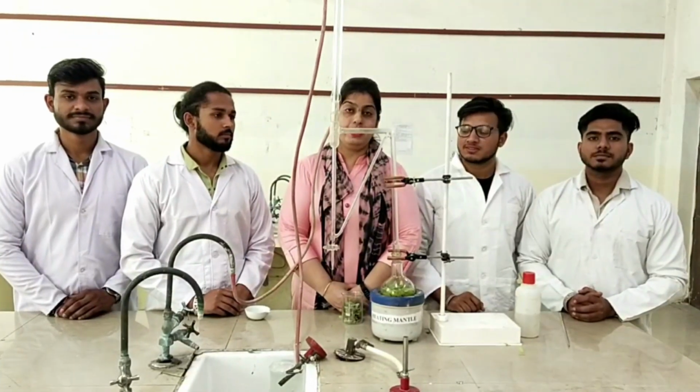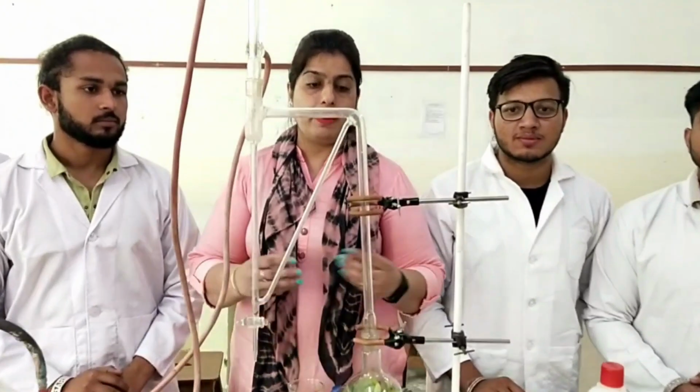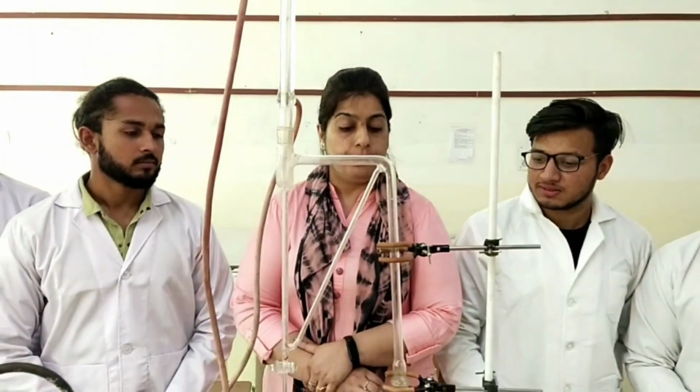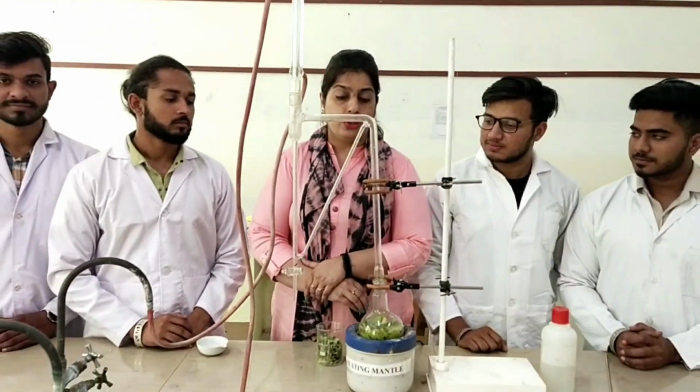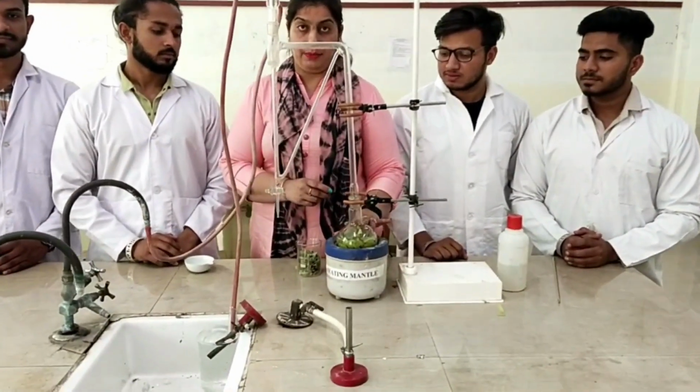Everyone, I, Divya from RPIIT campus, am here to demonstrate the Clevenger apparatus. This apparatus is used to extract volatile oil from eucalyptus leaf. Today we are going to isolate oil from the eucalyptus leaf.